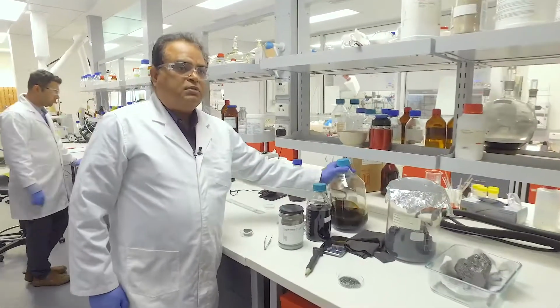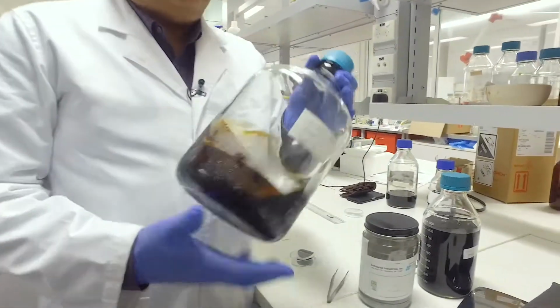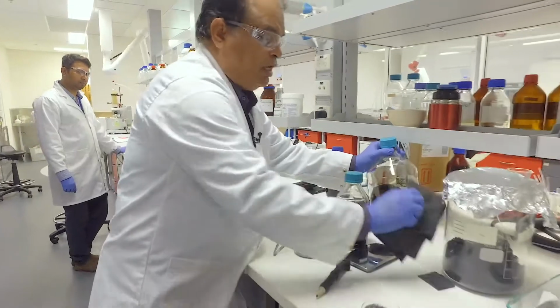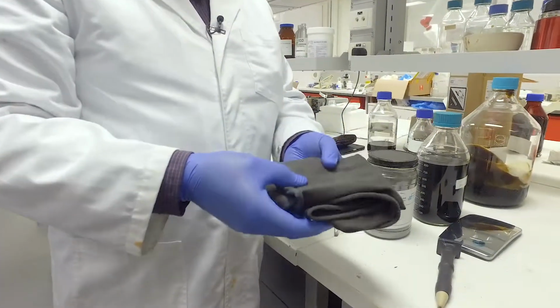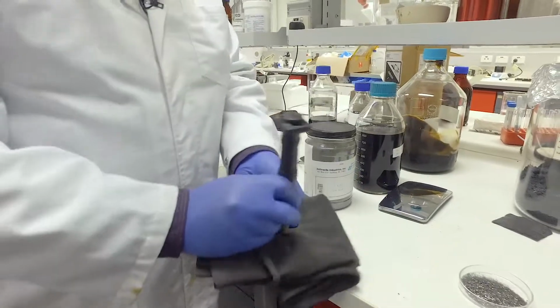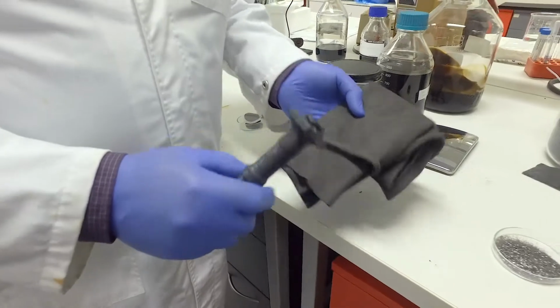So we have been using this material for a variety of applications, for spinning the fibers and for coating onto the fabric. This is one example. We have coated this material simply onto this fabric. And this fabric is very conducting, as you can see. It is conducting fabric just by simple coating and reducing the fabric.